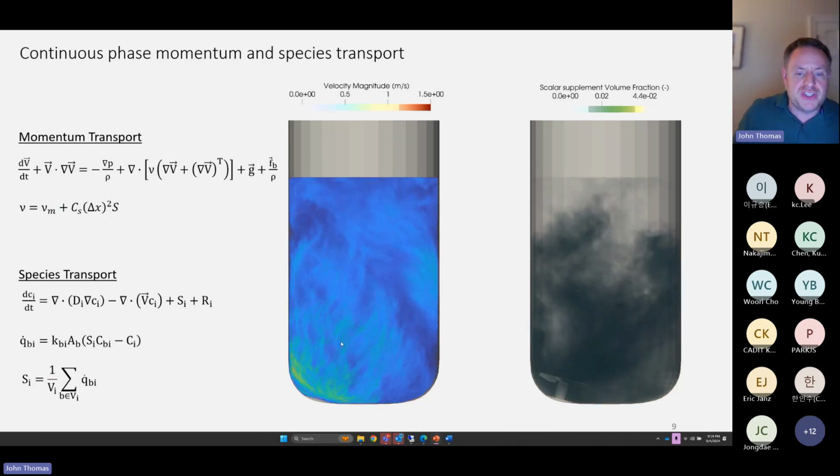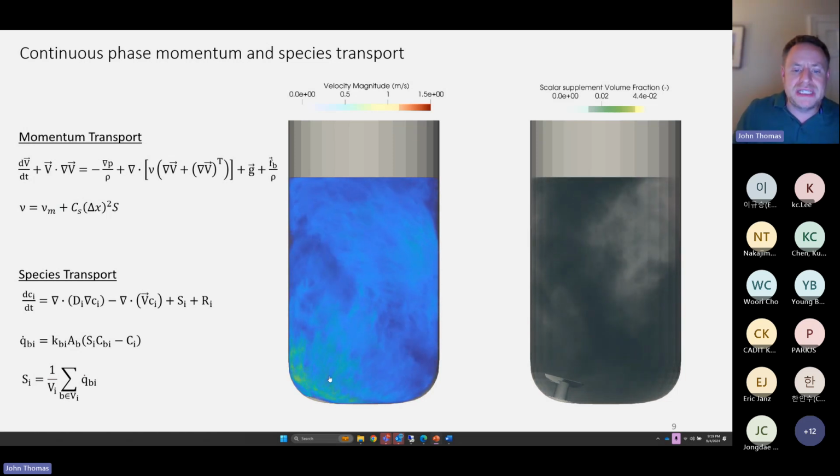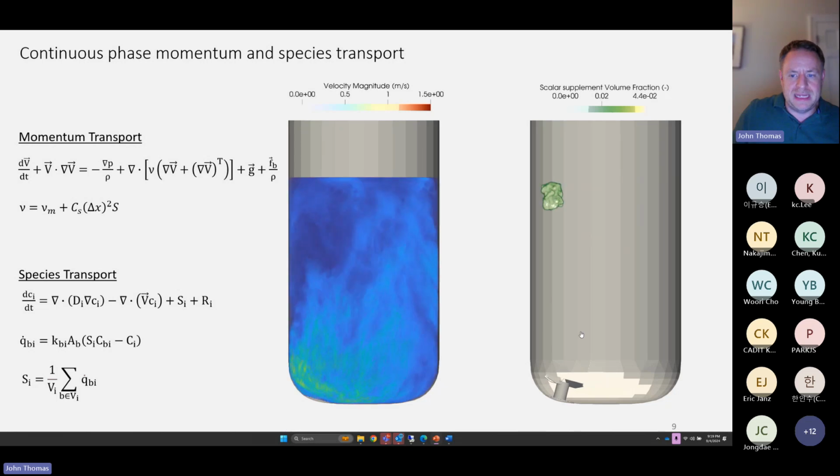So here we're modeling the transient three-dimensional flow field. We're seeing the velocity of the impeller. We're seeing the eddies discharge through the vessel. And we're seeing that macroscopic flow field evolve throughout the system. Now this is cool in and of itself, and this simulation is noteworthy in that I'm able to model minutes of process mechanics routinely on the laptop. And I'll go ahead and start this again to illustrate.